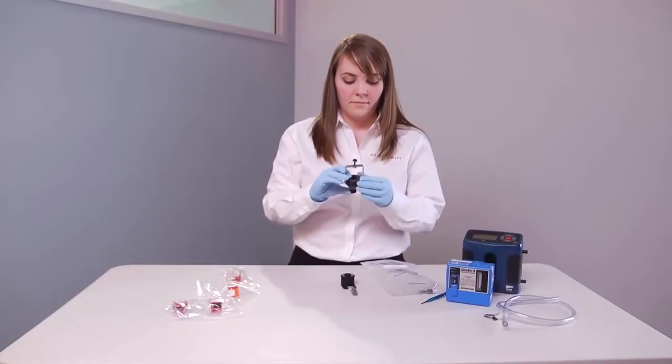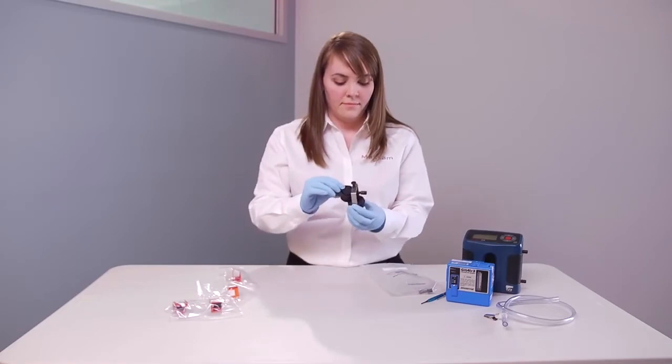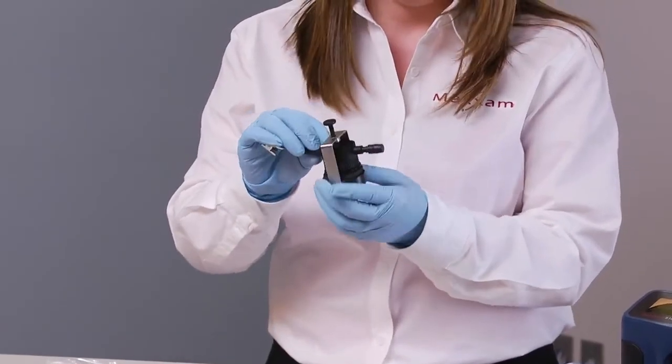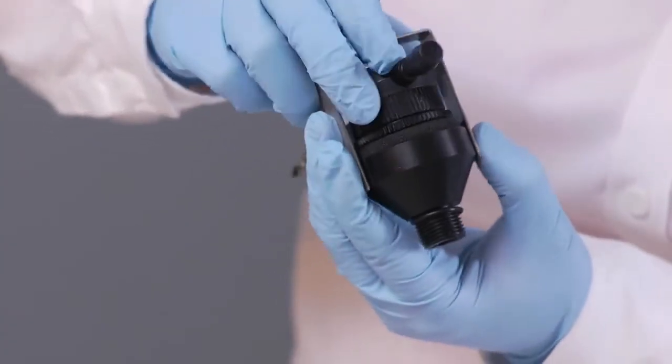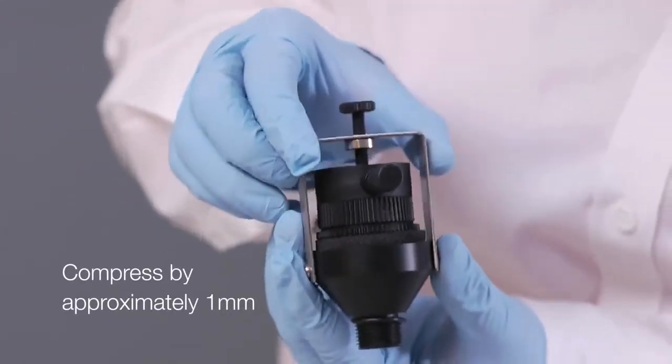Insert the IOM sampler through the hinged bracket of the adapter with the inlet of the sampler against the adapter's foam ring. Clamp the IOM sampler in place with the clamping screws until foam ring compresses by approximately one millimeter.